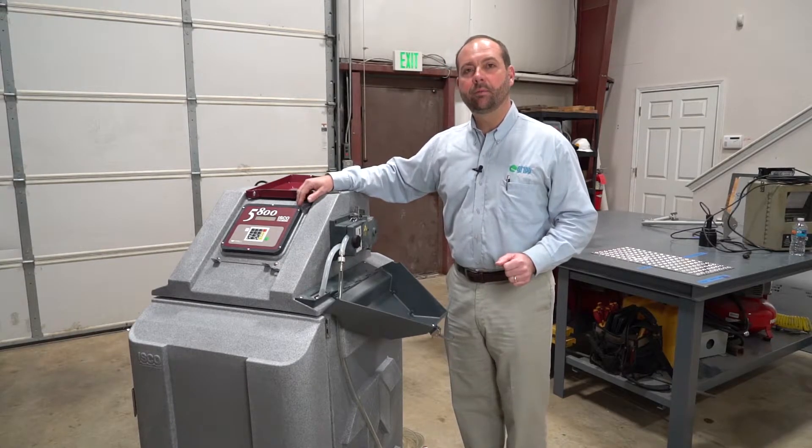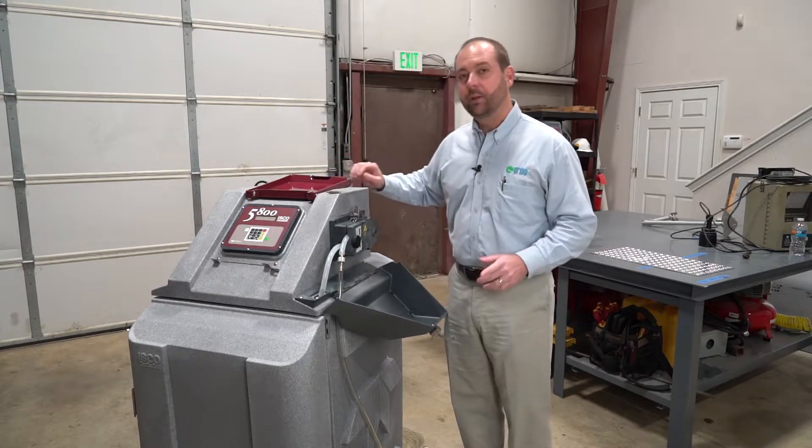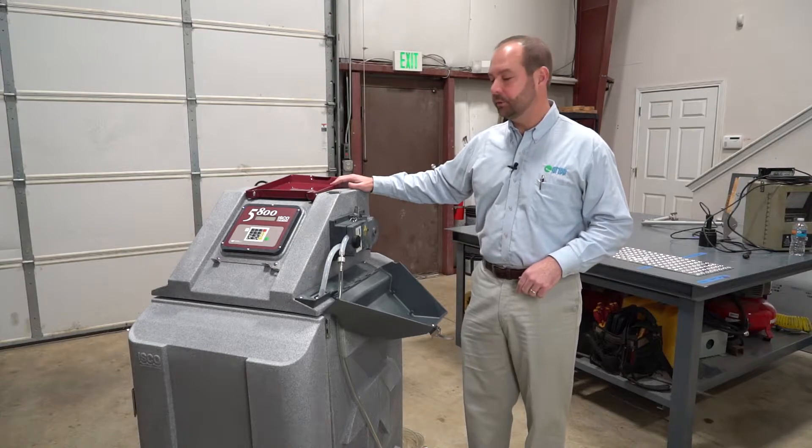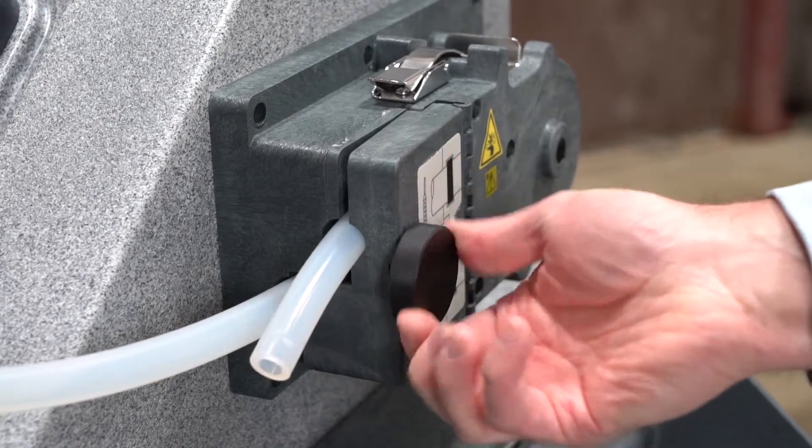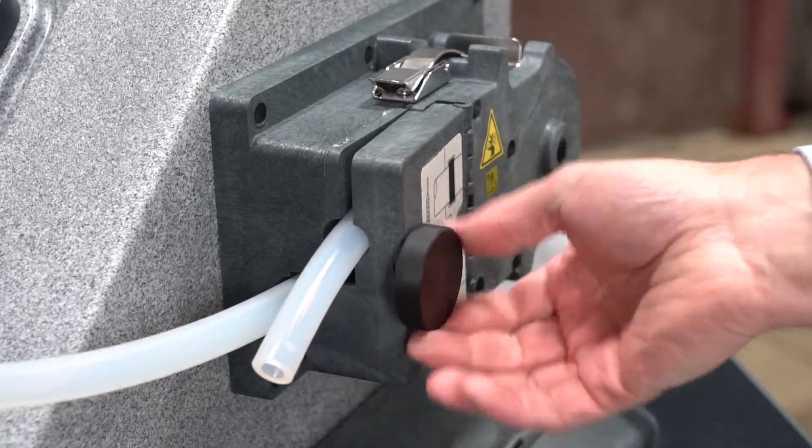Let's begin by powering off the sampler using proper lockout tagout procedures. The first step will be to open the liquid detector cover by unscrewing the black knob.